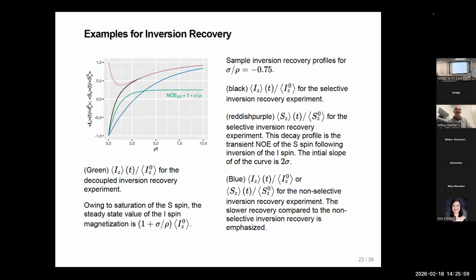It's one reason, for example, when I said we sometimes frequently will deuterate a protein and then back exchange the amide hydrogens. But frequently when we do that, we don't bother with deuterated glucose. So there are protons in the sample from the glucose that the bacteria are growing on.